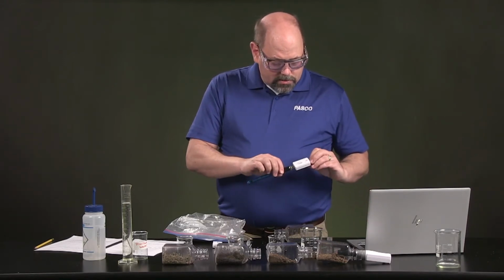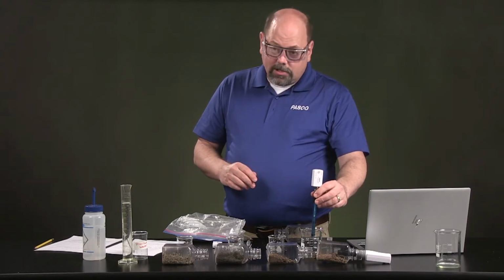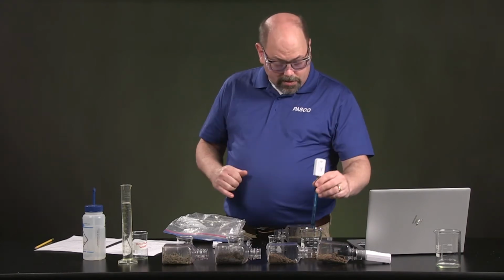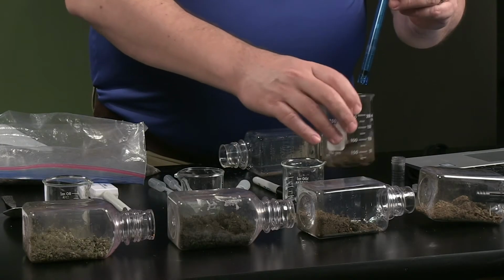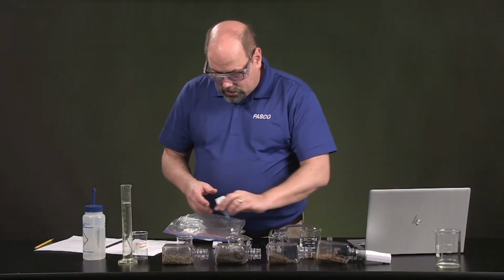You'll go ahead and turn that sensor on, and you're going to be able to go in. And again, if you can, not touch the actual soil itself, the glass probe is right there. So maybe if you're off to the side, you can slowly move those. Make sure that this is sitting for a couple of minutes while it's dissolving, and then you'll be able to measure each of these.